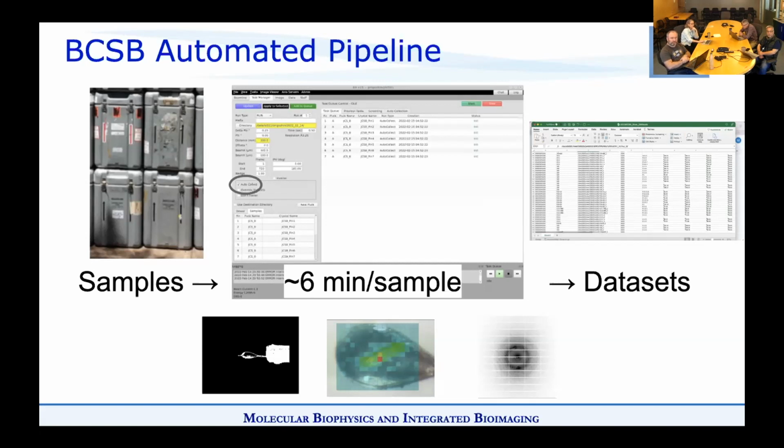The approach in this automated pipeline is that it does loop centering. And then after that, on the loop, it does a raster approach in order to find indexable spots in the rastering. And then from those indexable spots, it aligns the center 90 degrees away from that. And basically, you would get your full data set. So this could be used for screening for data sets. And right now in Gemini, we're using the automated pipeline to get all the data sets that we need. So that you will need as well. So thanks a lot. And at this point, Jay.